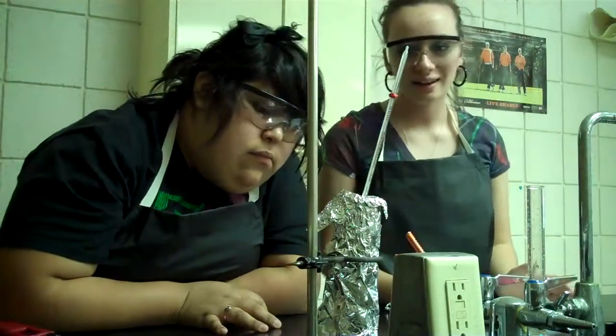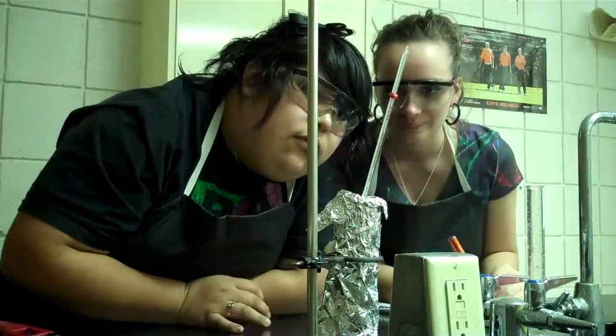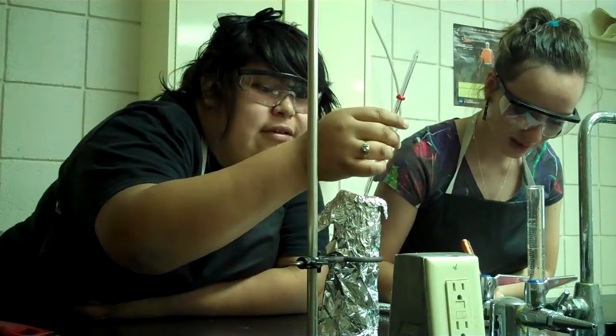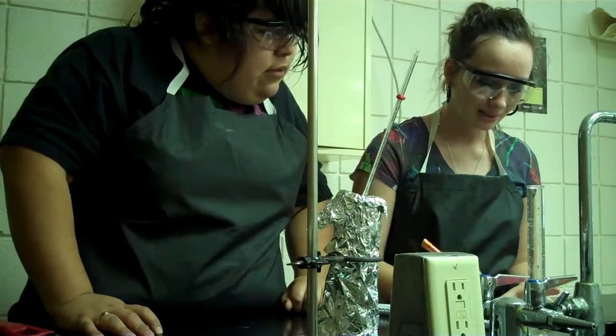It's burnt out. Now we will record the temperature of the water after the burn. It is 39 degrees. So with 50 grams of H2O, now we will calculate the change in calories.